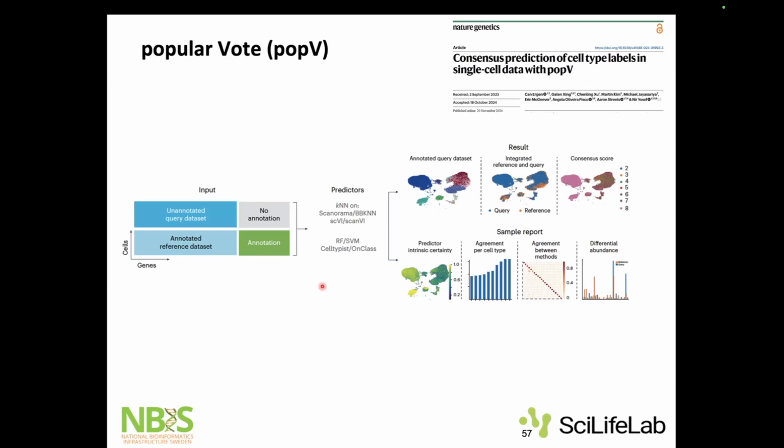If you want the training to happen, it's going to take, for example, I don't know, 1 hour, 2 hours. If you just use the training that they did themselves, then it takes less. But I assume they did train them based on certain data. I don't know. Anyway, they used 8 methods here.